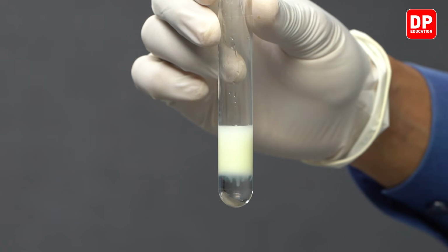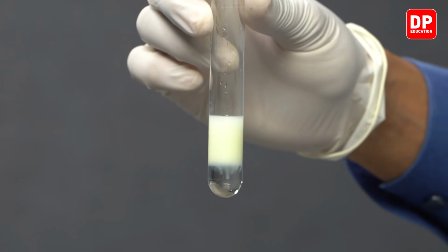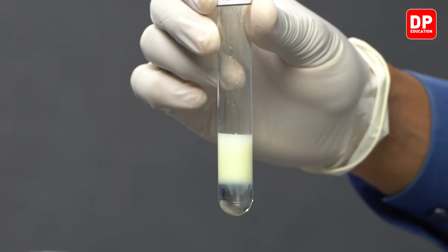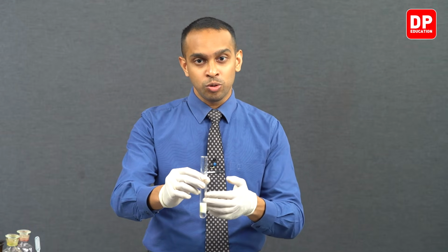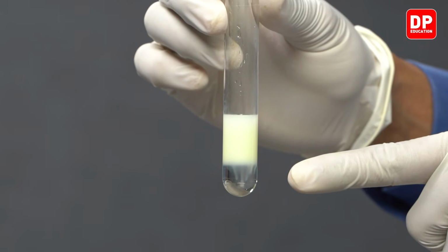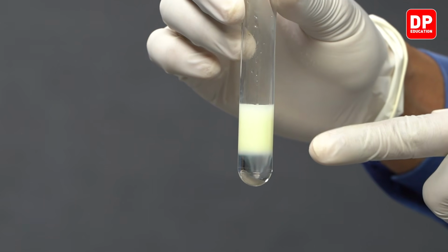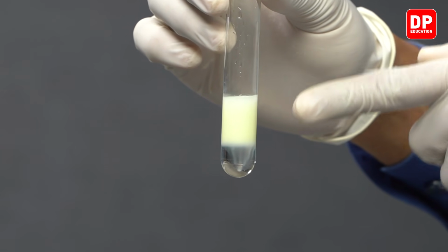This is due to thiosulfate ions reacting with hydrochloric acid to produce sulfur and sulfur dioxide. So the sulfur dioxide that is produced is removed from this system. However, the sulfur that is produced here is going to be present as colloidal sulfur, or as you commonly know it, solid sulfur.